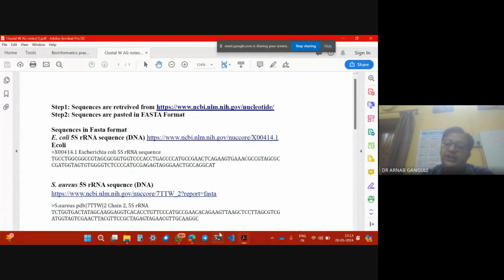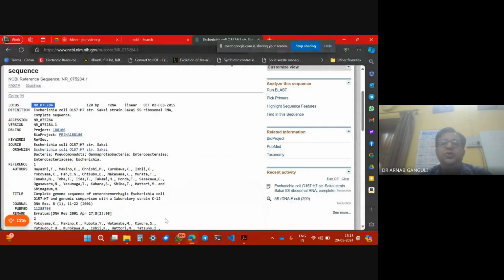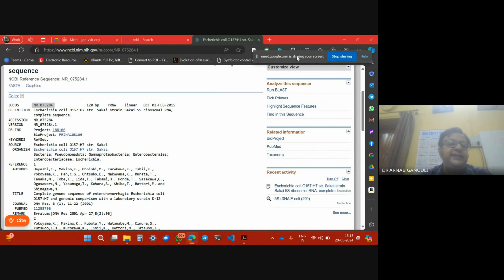You can use what I've given you over here, or you can do this search on your own. I would request you to do this search on your own instead of copying and pasting everything. It is very easy. So take a printout of this page.